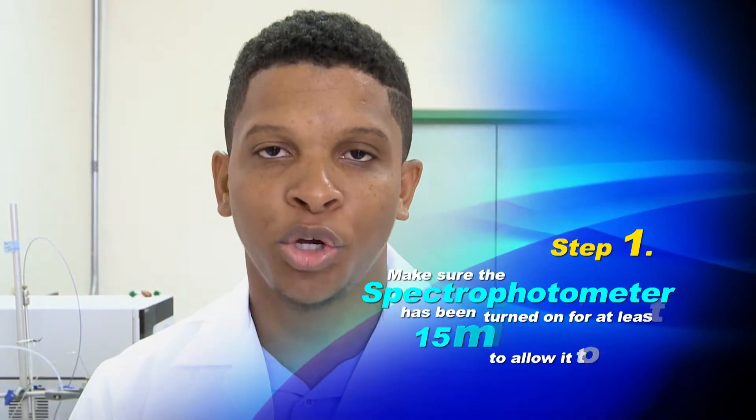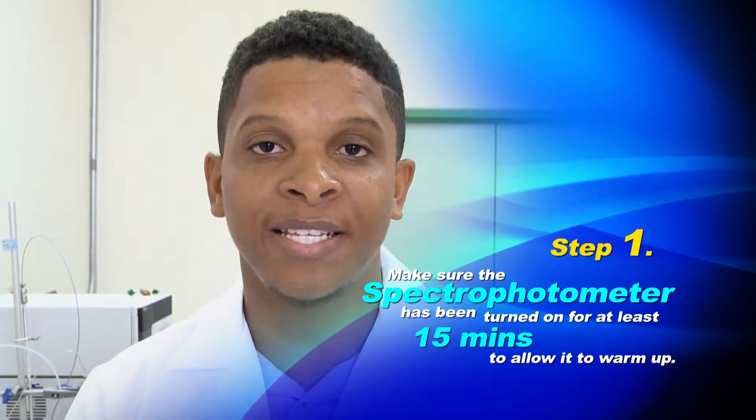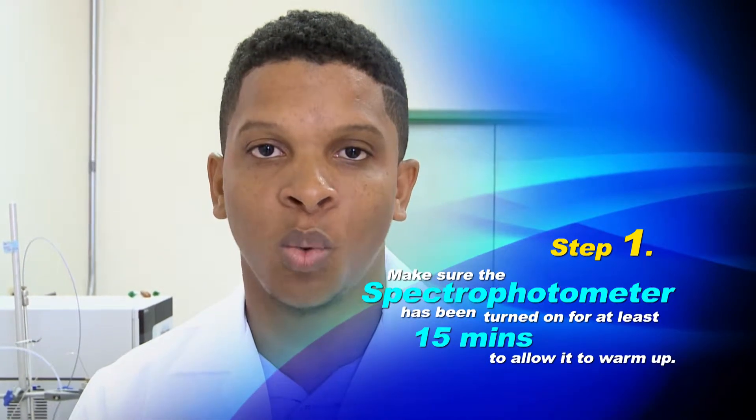Your task is to find out what will happen when we measure solutions of increasing concentrations. What do you expect? Remember, a spec measures the amount of light passing through a solution. So with that in mind, let's run a simple experiment. Step 1: make sure your spec has been turned on for at least 15 minutes to allow it to warm up.